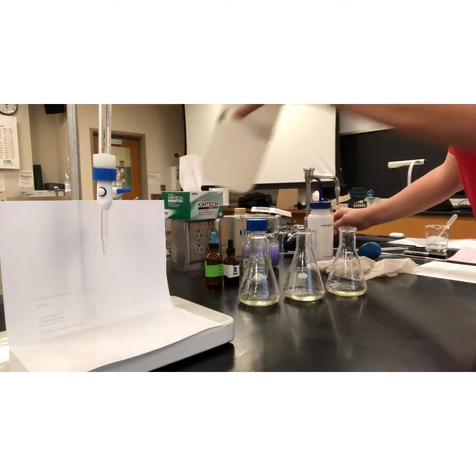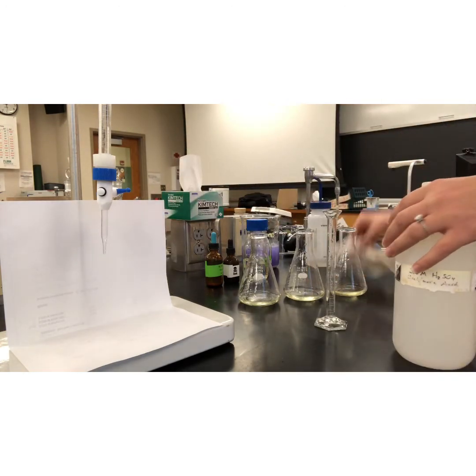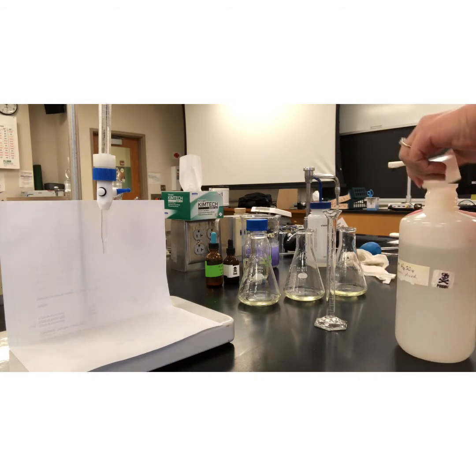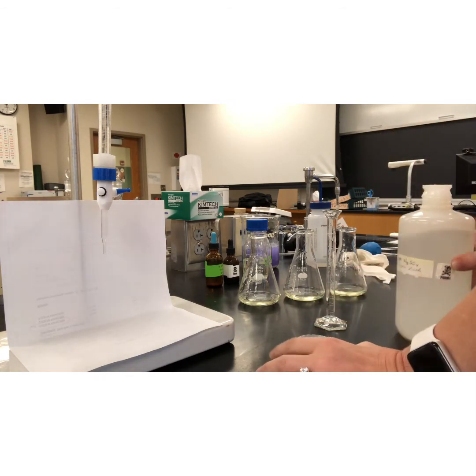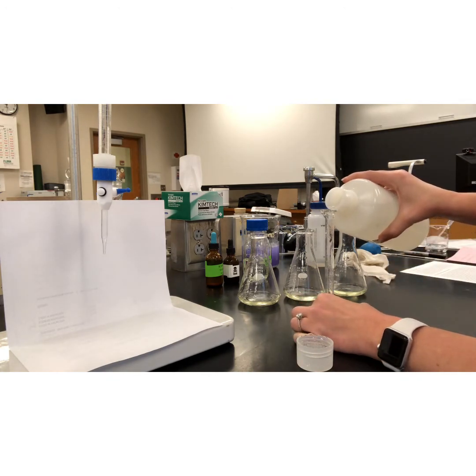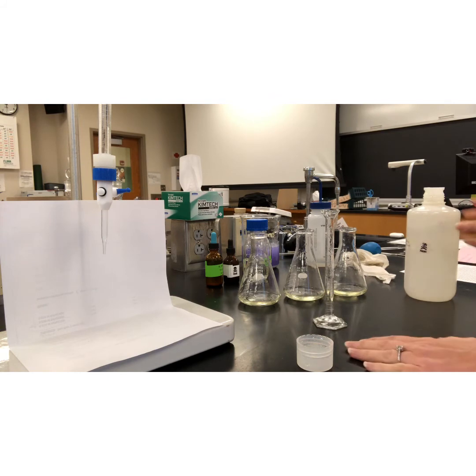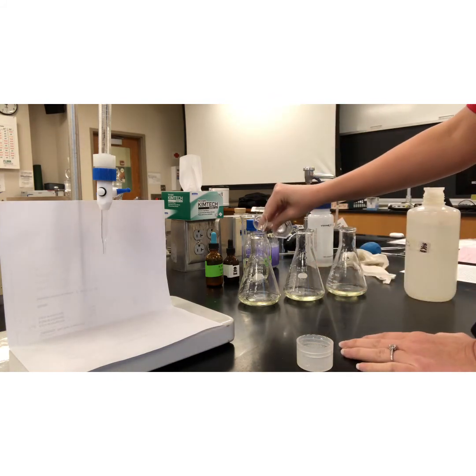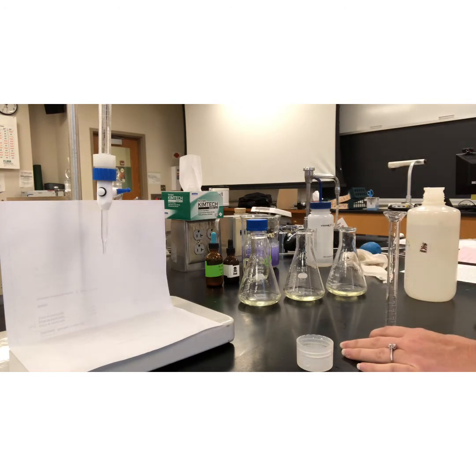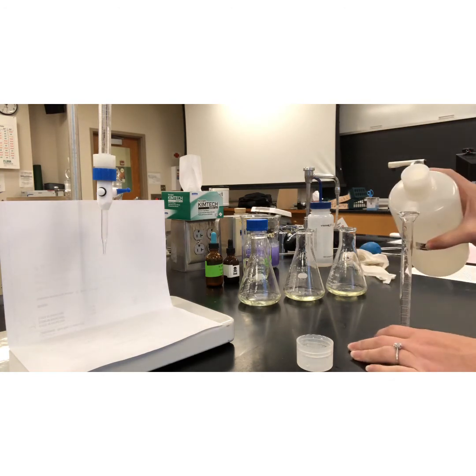All right, so this time I'm going to go ahead and just divvy up my sulfuric acid for all 3 of them from the get. I think it'll be fine. Speed this process up. All right, about 5 milliliters into sample number 1. Here. Sample number 2.